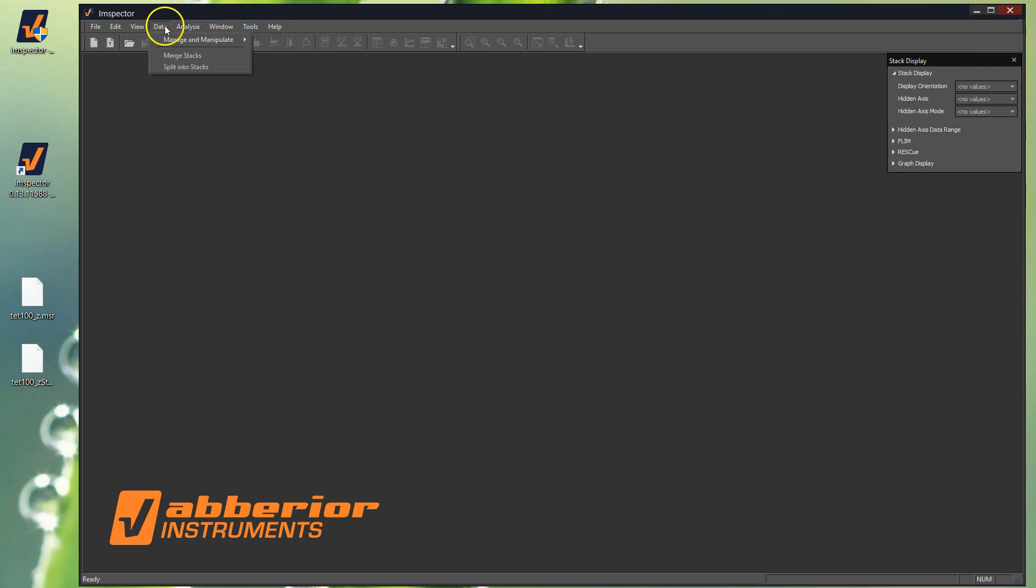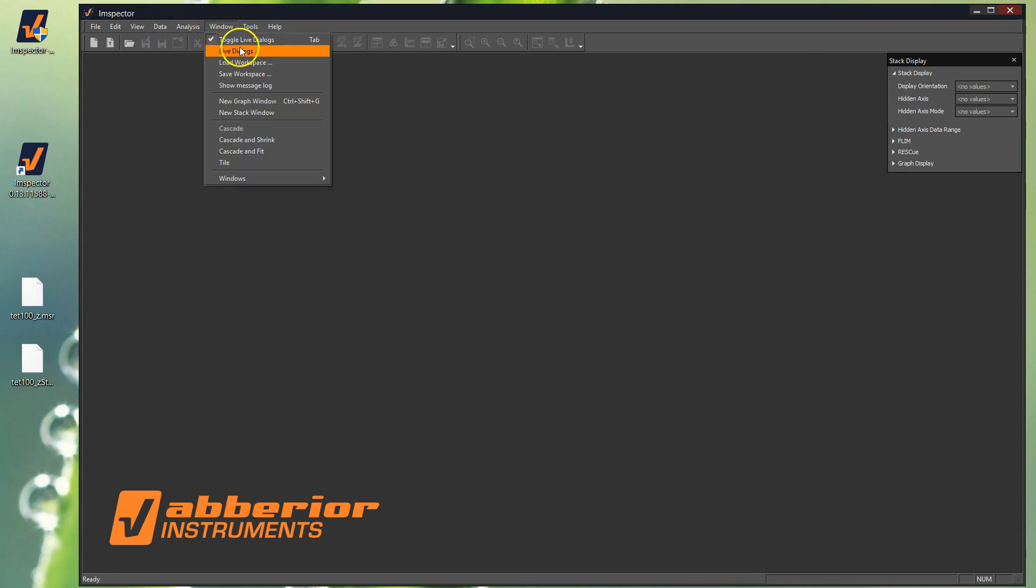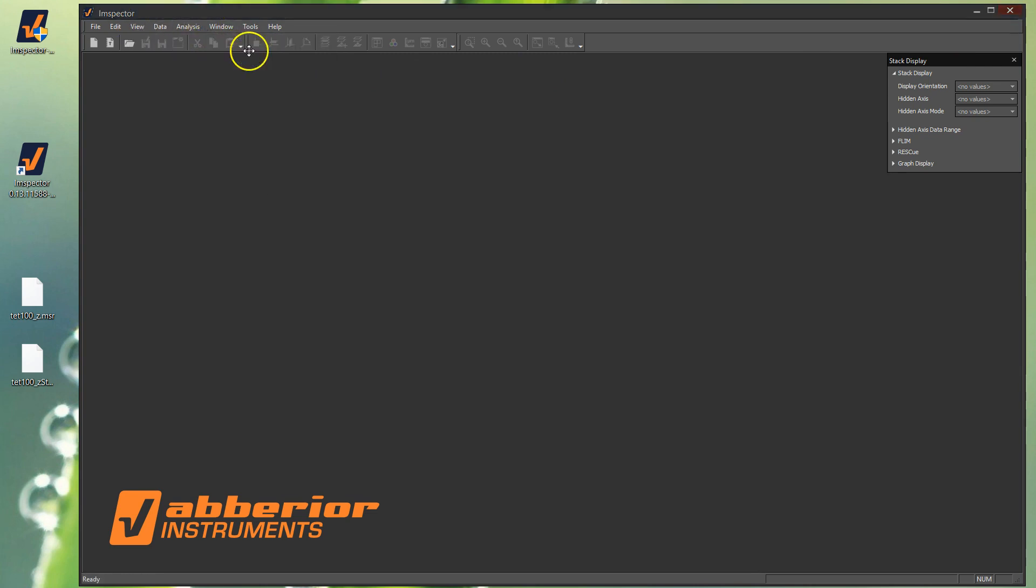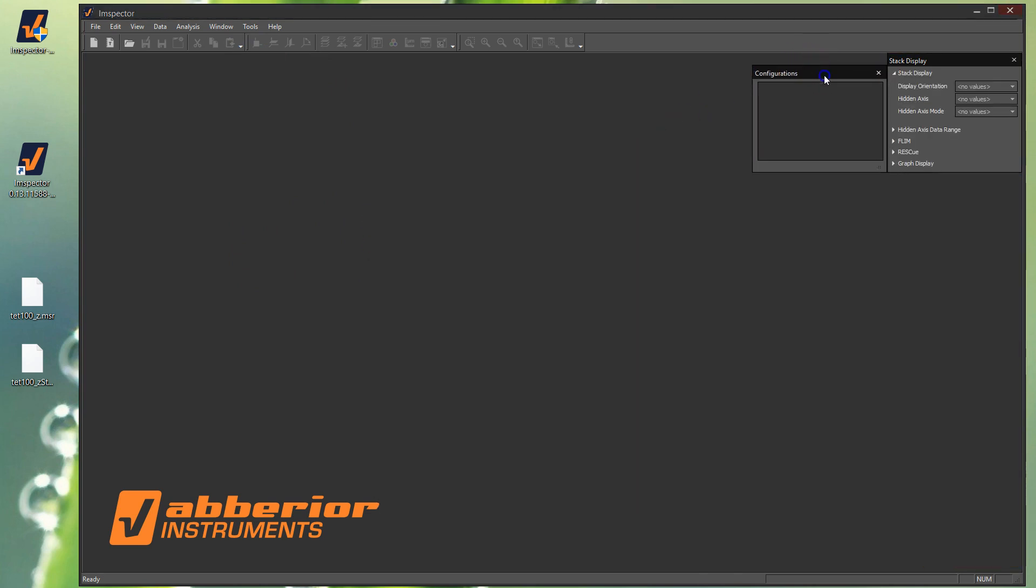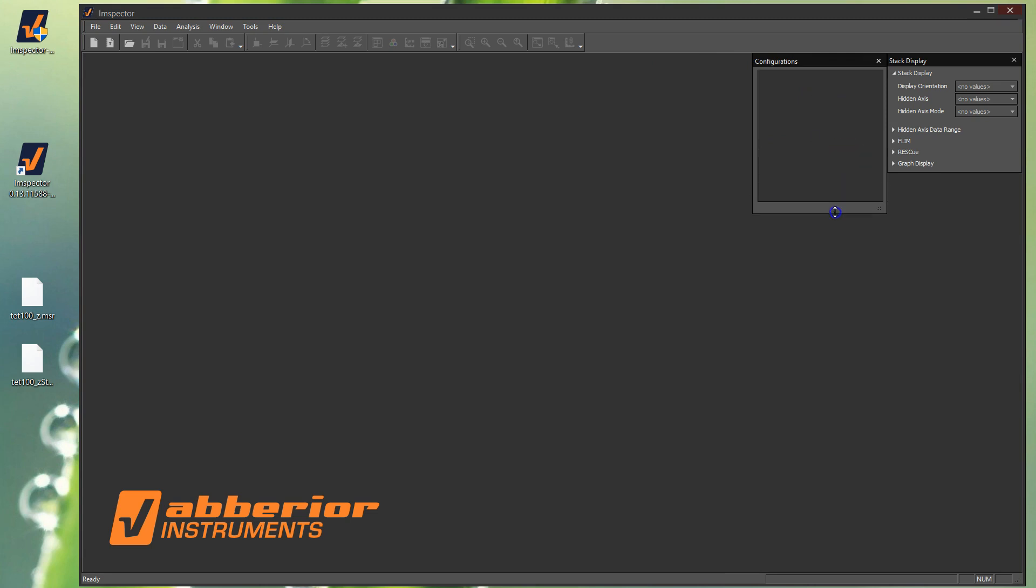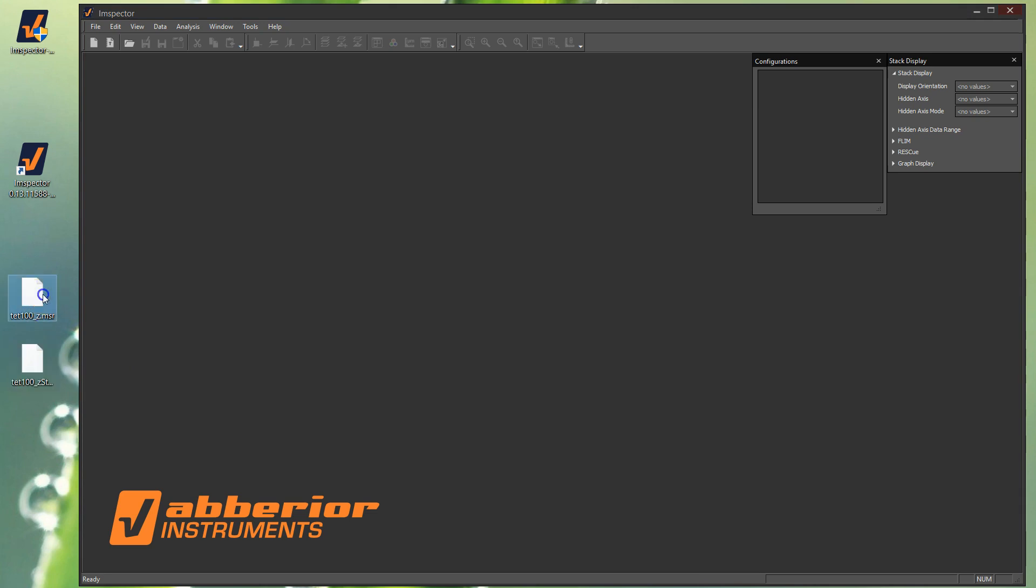So we did that and this stack display is somewhere else and you can clip it onto the window. Another one that you may want to use and we'll look at in a minute is if you click on Live Dialogues and then select Configurations, that brings up this one. Again, this window may be somewhere else, but you can bring it and clip it on.